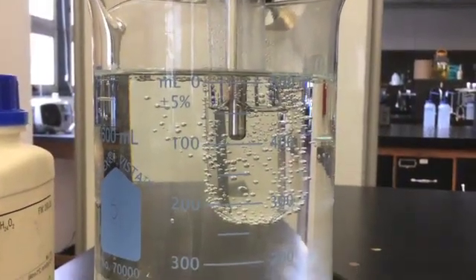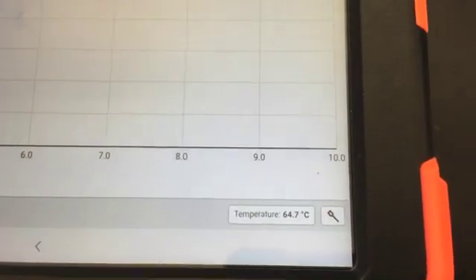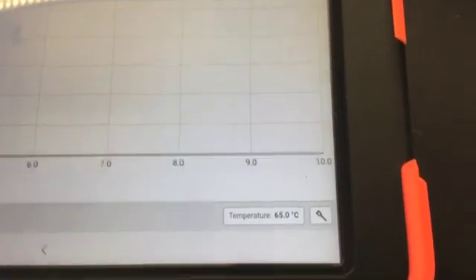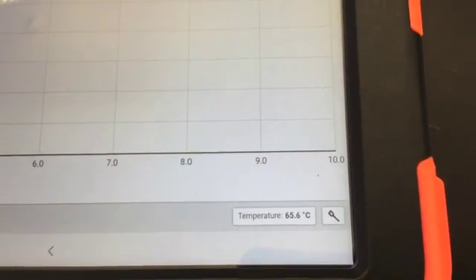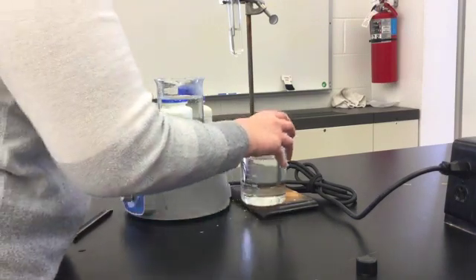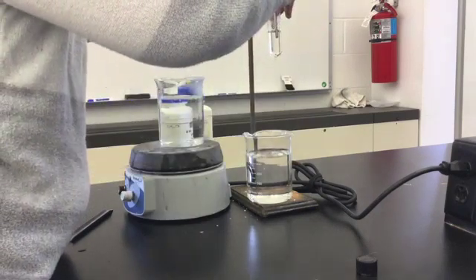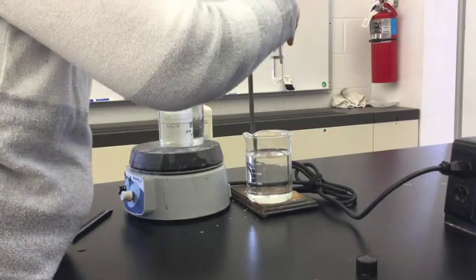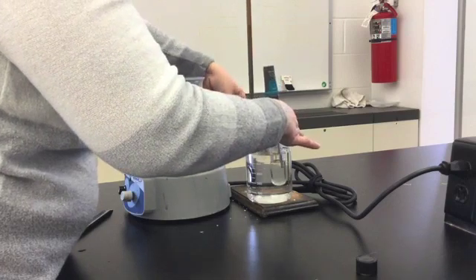Once the lauric acid is completely melted, you can begin your data collection. At this point the temperature is reading well above 50 degrees. We can start at any temperature above 50 degrees, though if the temperature is in the 90s or near 100, that would probably take quite a while. It takes about 45 seconds for the temperature probe to adjust to the temperature of your liquid. In the meantime, you're going to lower the test tube into a room temperature water bath.